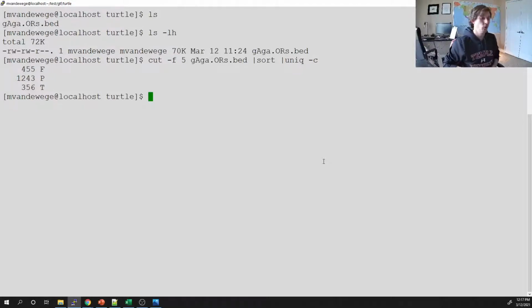Right, and so y'all don't know this, I know this, but that's a very high pseudogene count. That's really high. To see more than half of all annotations be pseudogenes, that's high. And this is on a turtle. I can show you what turtle this is from. Gopherus gazi.